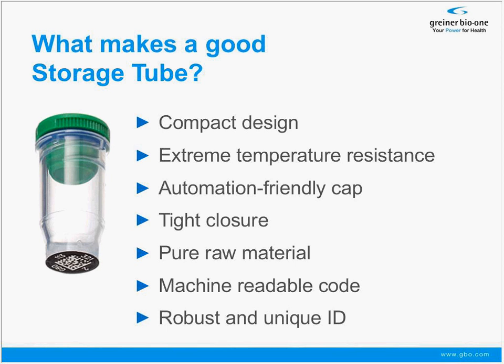All the other things listed here are related strongly to the title of this presentation, namely the quality of your biobanking approach. The first one was a bit more cost associated, but everything that's coming now is quality related. The first point is the tube must be resistant to extremely low temperatures.